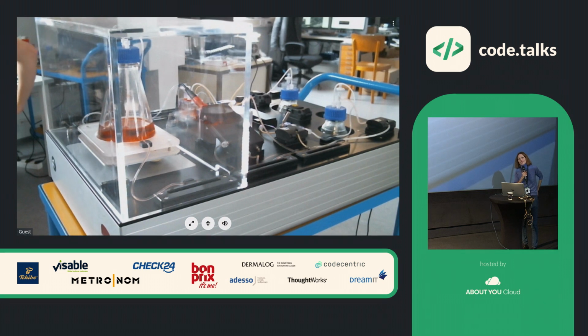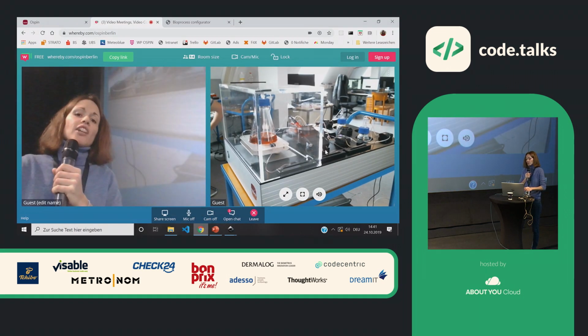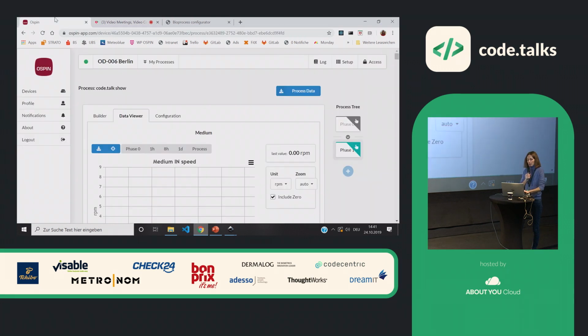The key here is the following: if the customer says, now I would like this module, we need to make sure that we can just ship the module and he can build it in, and he doesn't have to do anything on the web app side. The machine just recognizes there is a new module and sends a new process description to the UI, and the customer doesn't have to do anything on his side.